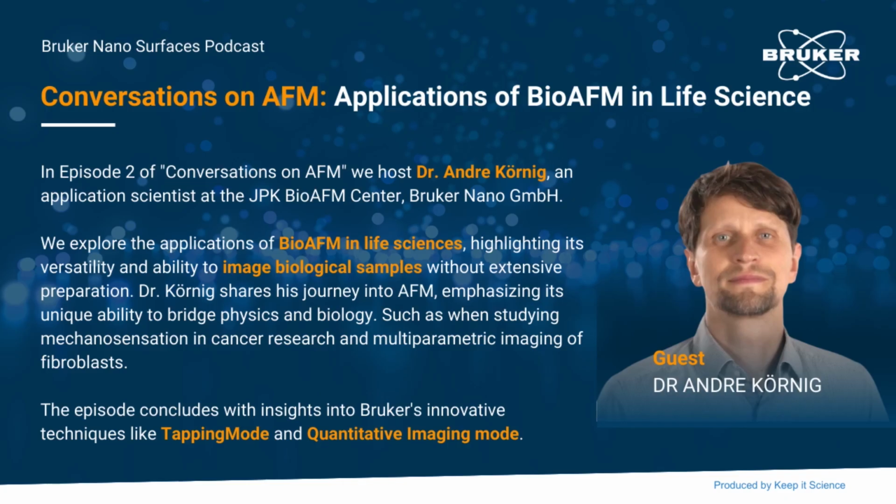That sounds absolutely amazing, especially the arm measurement. I think we're all crazy scientists, but I'd never heard about someone putting a whole arm under an AFM. So we had to do some adaptation to make it a bit larger, the whole stage and so on. But this was kind of an idea. I don't know why he wanted to do it. I just saw the picture, and this was his idea. I think it was about some skin measurements or something like this.